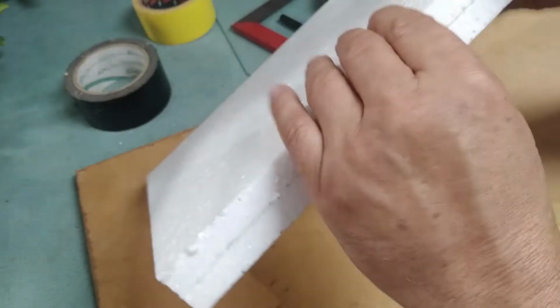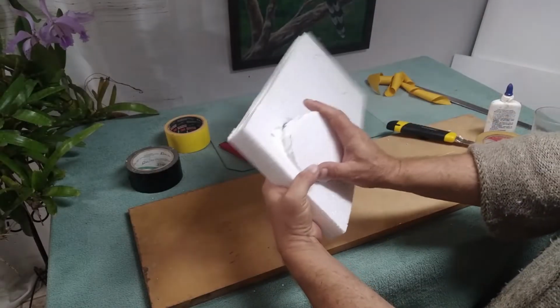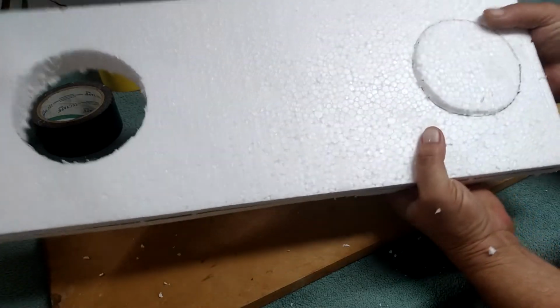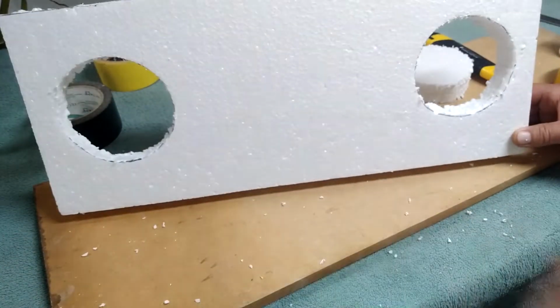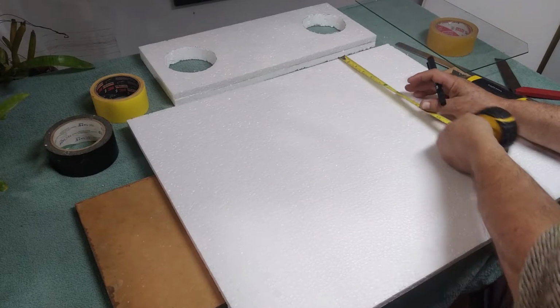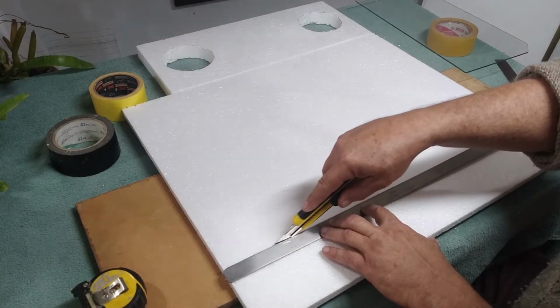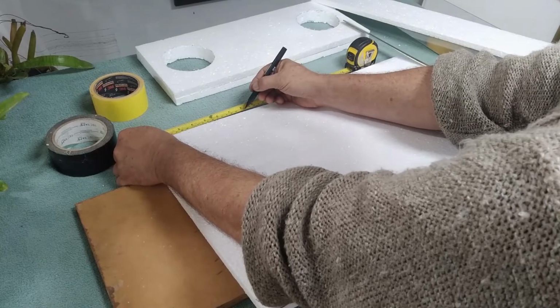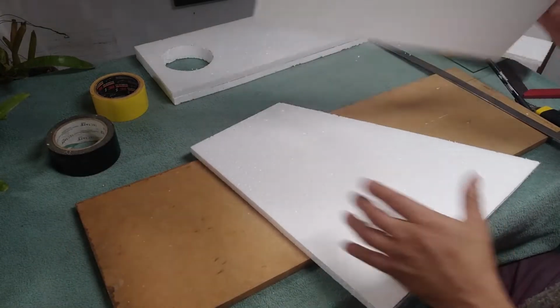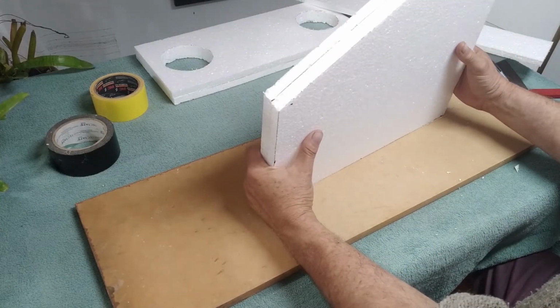Okay, so this is the front side of our box. Now let's cut these holes open so we can fit our gloves later on. For the side walls, we start out with a sheet of 40 by 60 centimeters. On one side, we mark 20 centimeters on top. On the other side, 20 centimeters in the bottom. Now we cut the diagonal between these 2 points. That gives us 2 identical pieces, 20 centimeters tall on one side and 40 centimeters tall on the other side.